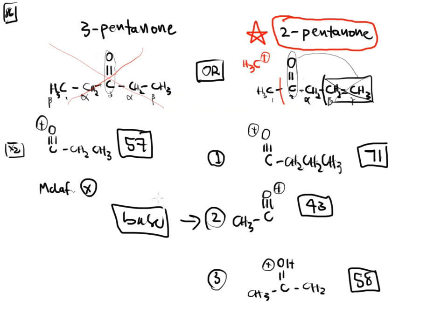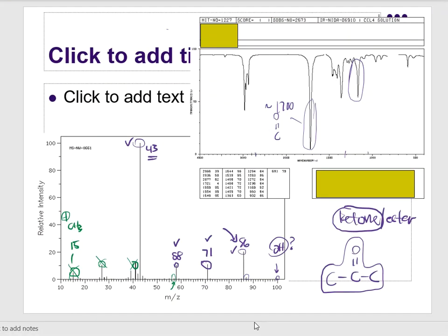So once again, we have used an infrared and we have used a mass spectrum to completely identify a molecule that was injected. And I wasn't there to inject it. I had no clue what got shot onto those instruments. And based on a series of squiggly lines from 2 different instruments, I was able to determine the complete identity, including isomers, the complete identity of that molecule that was analyzed.